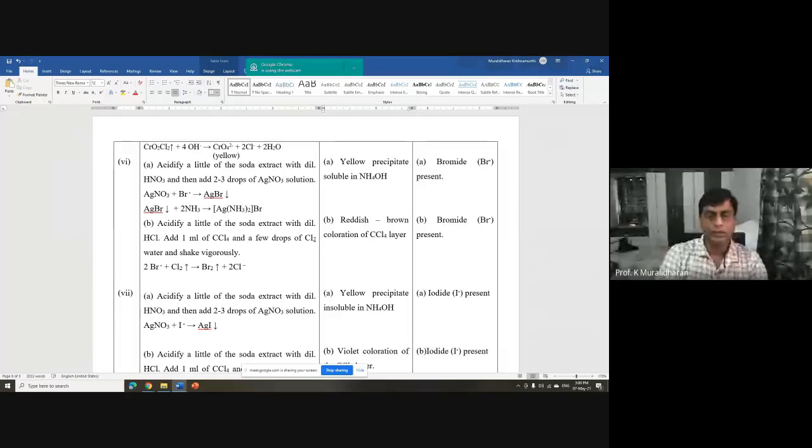But remember that chlorine gas is dangerous. It is an anesthetic. If somebody happens to smell too much chlorine continuously for 3-4 minutes, they will faint. But remember that you don't need to worry here. In the laboratory, the quantity you are using is only 2 to 3 milligrams. So if at all it is coming, it may not even come out from the test.